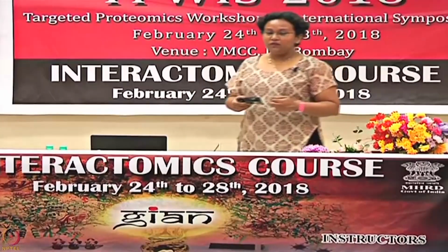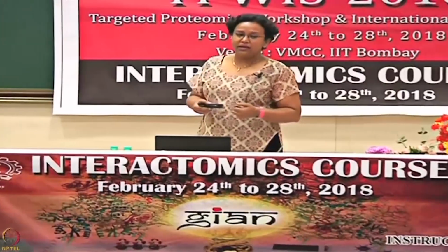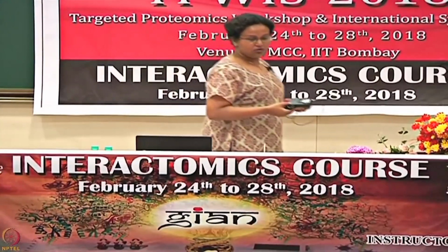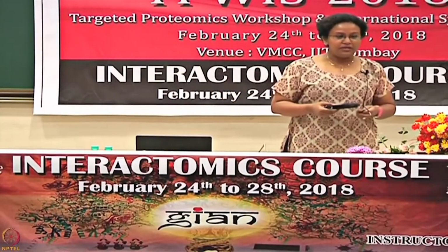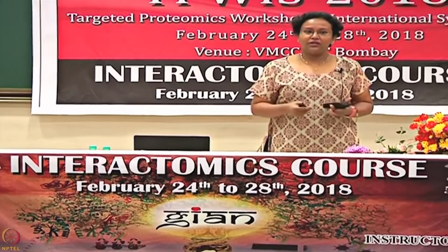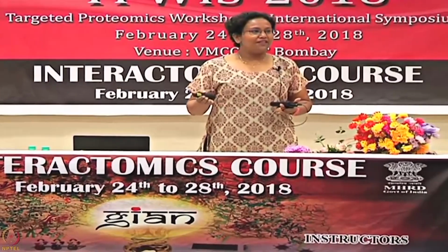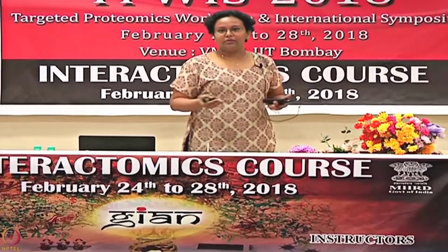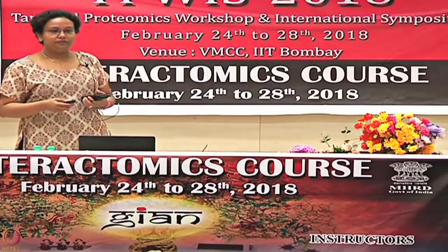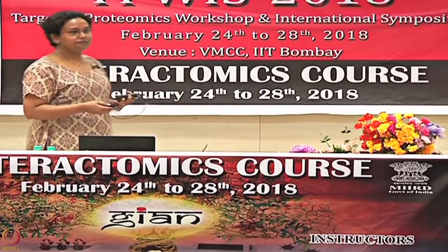So, if you get 600, since your theoretical Rmax is usually higher than your experimental Rmax, we typically go ahead, and if it is 600 from your theoretical, I would immobilize 700 or 800 to compensate a little bit and then start your experiment. Okay. Is it okay?